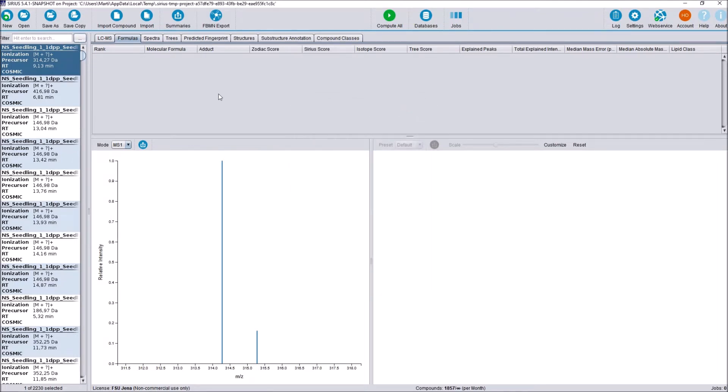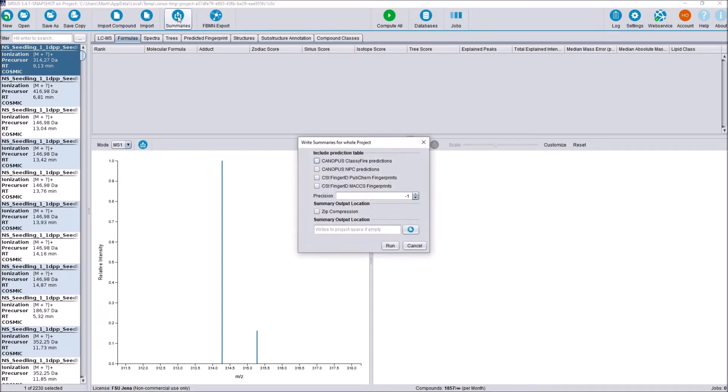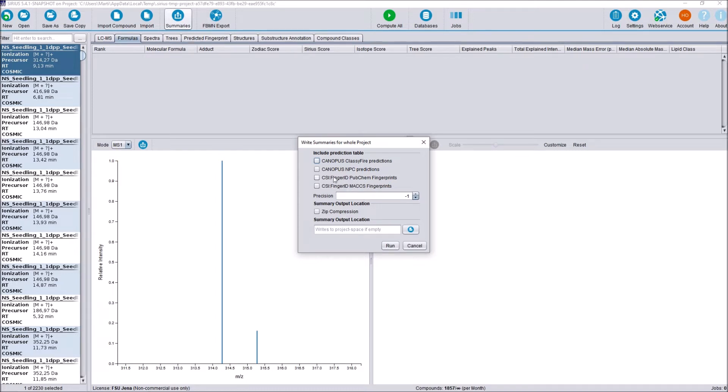The next structural change is when we write our summary files here at the end of our analysis. We are now able to include all CANOPUS classifier predictions as well as all CANOPUS NPC predictions. And we can also write different fingerprint types for our CSI FingerID analysis.